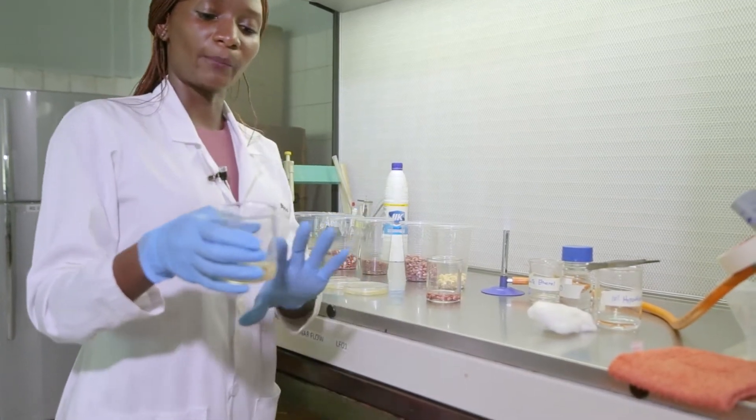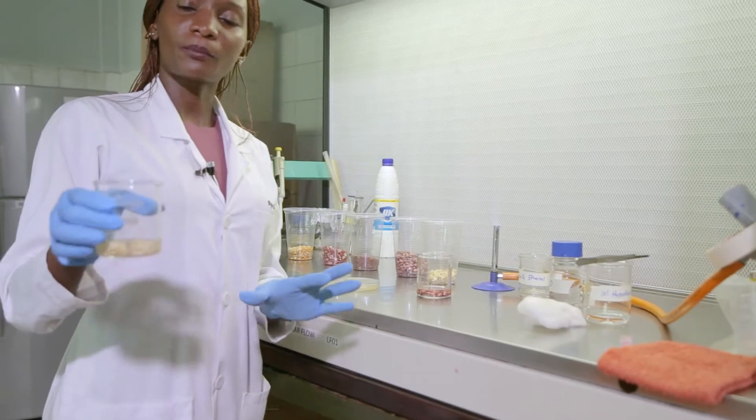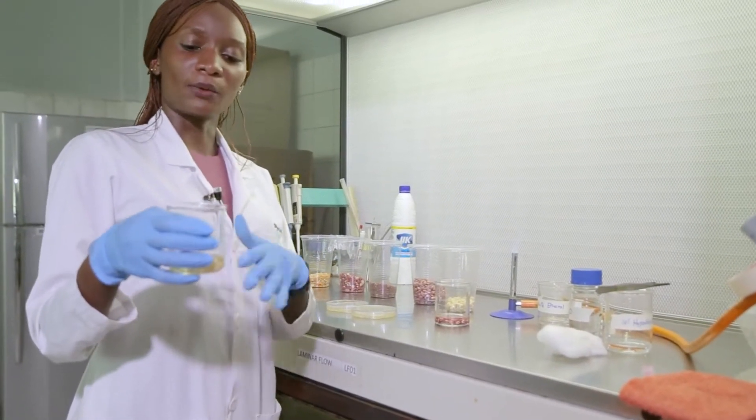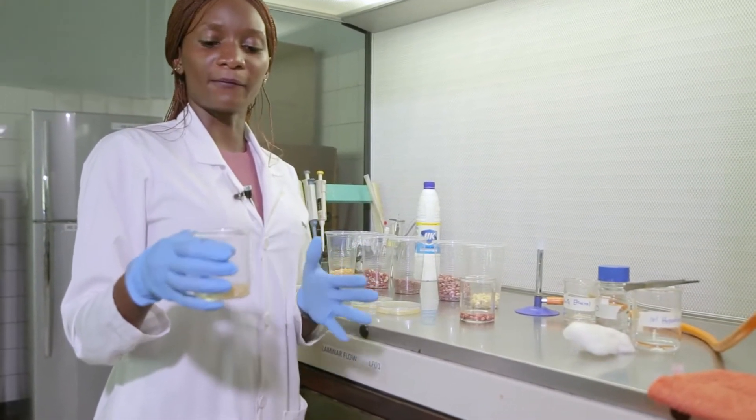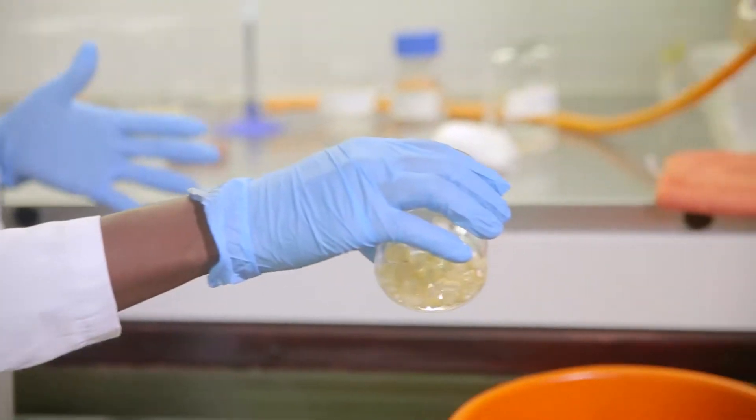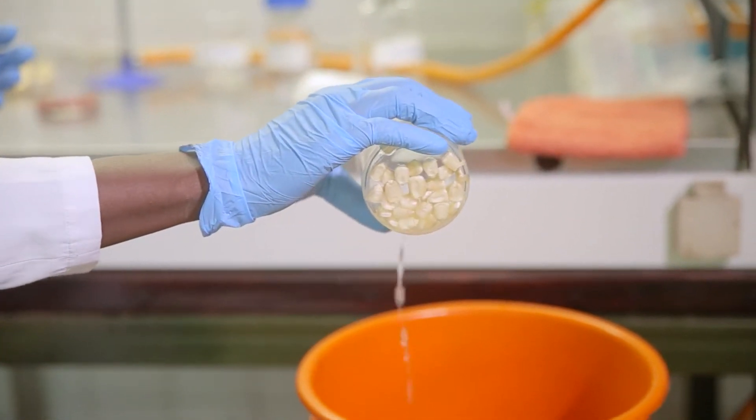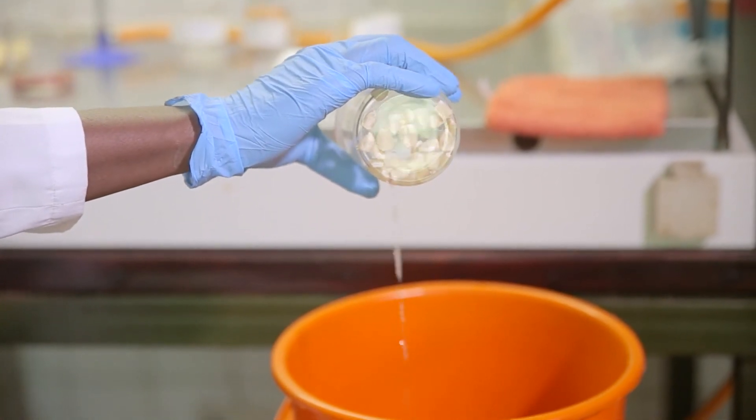So the reason I put the hypochlorite here first: I want to disinfect the outside part of the seeds. I want to remove any fungi that may be on the surface of the seeds, such that whatever grows will be coming from the internal part of the seed or the grain.